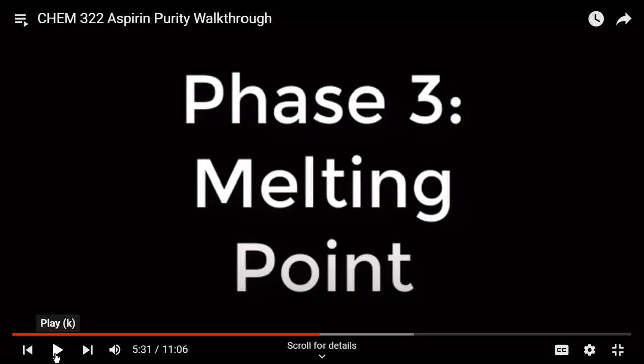This was one way to determine if your compound was what you said you had: check the melting point. Actually, I was telling the class yesterday, this is one way that Percy Julian, a highly notable African-American organic chemist and entrepreneur, disproved a synthesis. I can't remember the chemist, but he was British, and he published a paper saying, I made such and such compound, and these are the characteristics. This is the melting point, this is the TLC data, and so on.